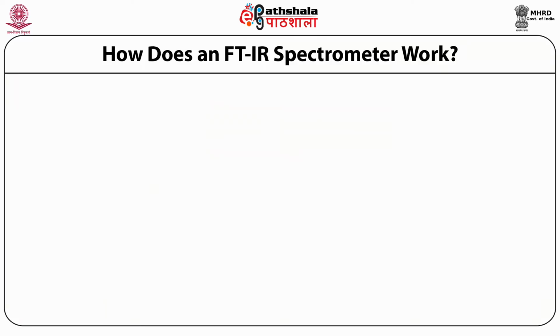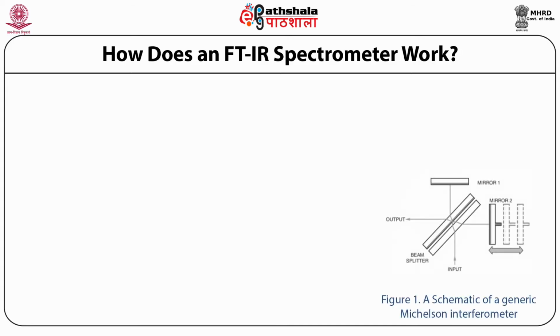Let us now discuss how the FTIR spectrometer works. Before that, first we will discuss the Michelson interferometer. The FTIR is typically based on the Michelson interferometer experimental setup. An example is shown in this figure.